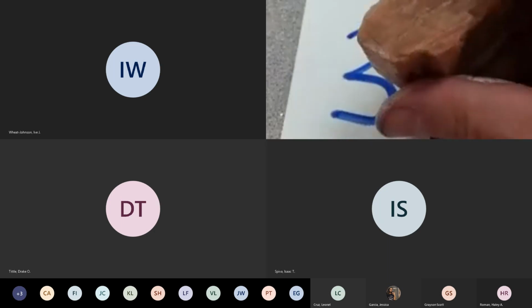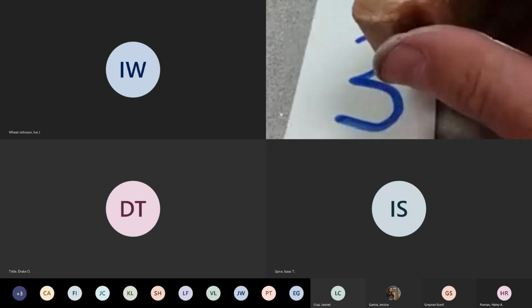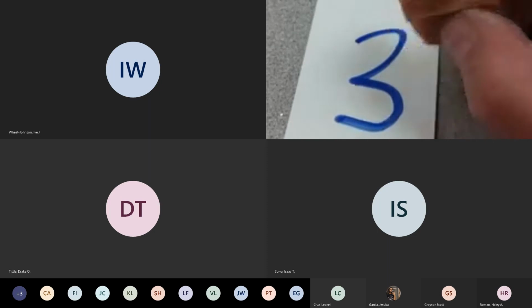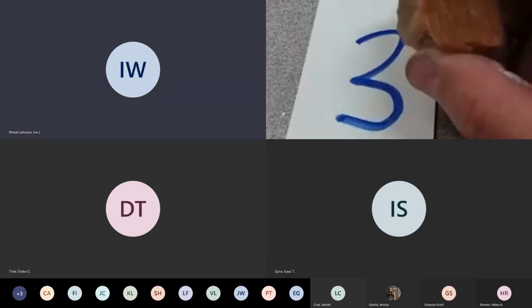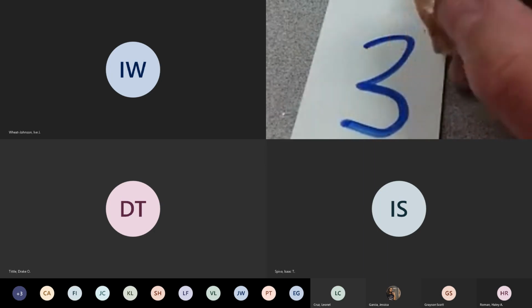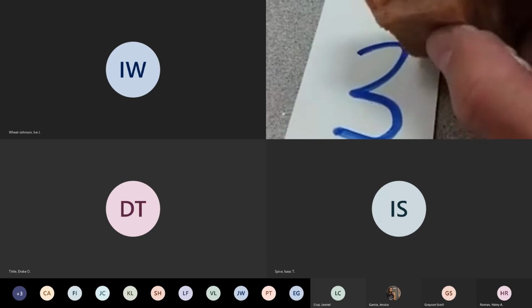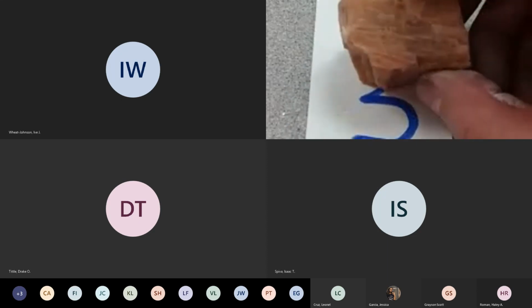Color, you might have said orange, you might have said salmon, you might have said pink. It's a pretty hard one to describe. Caramel brown, but this one usually has a distinctive color. Amber, dark brown, orange, terracotta. Those are all kind of in the neighborhood. You know, it's not something that was just burnt orange. That's good. This did not leave a streak.